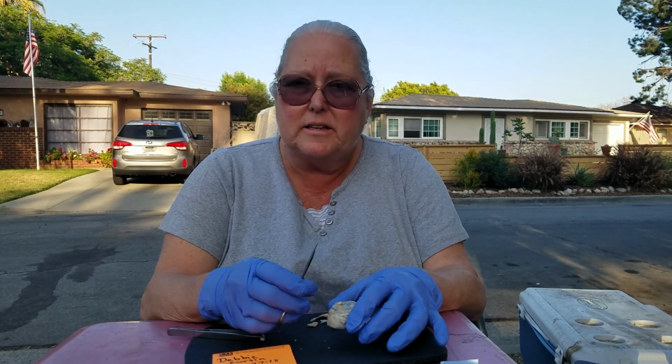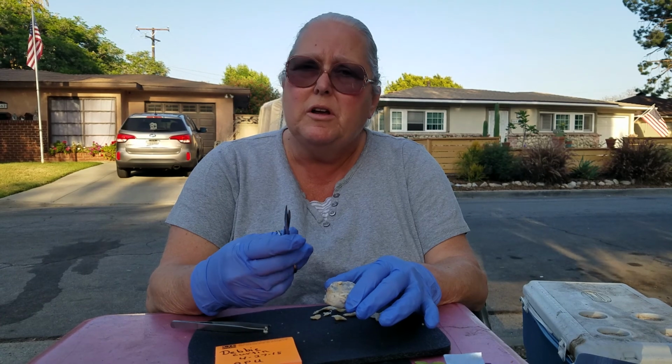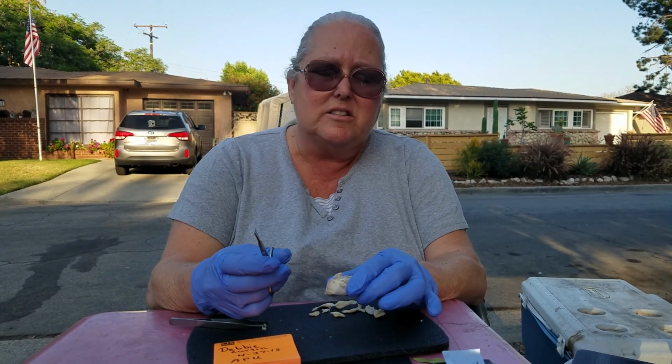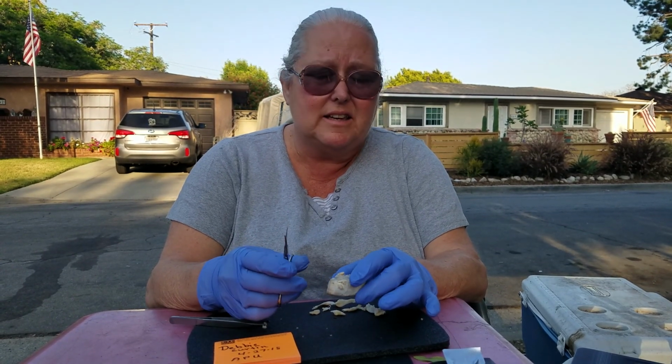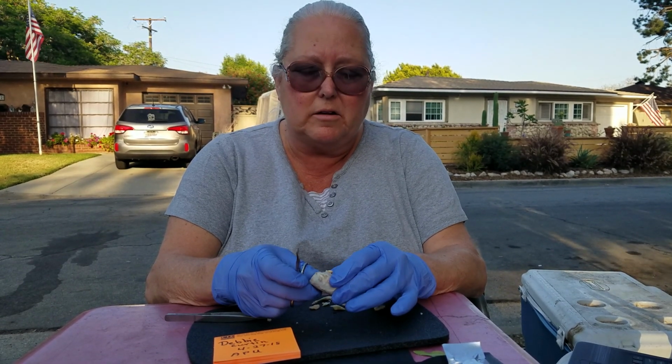I'm going to begin my dissection by explaining that you should wear goggles when doing this procedure. Because I wear glasses, the goggles disrupt my vision and I can't see, making it unsafe for me, but at all times you should be wearing goggles.